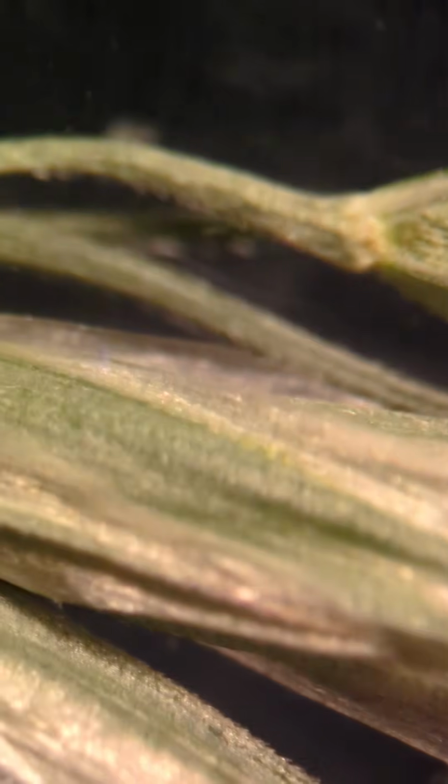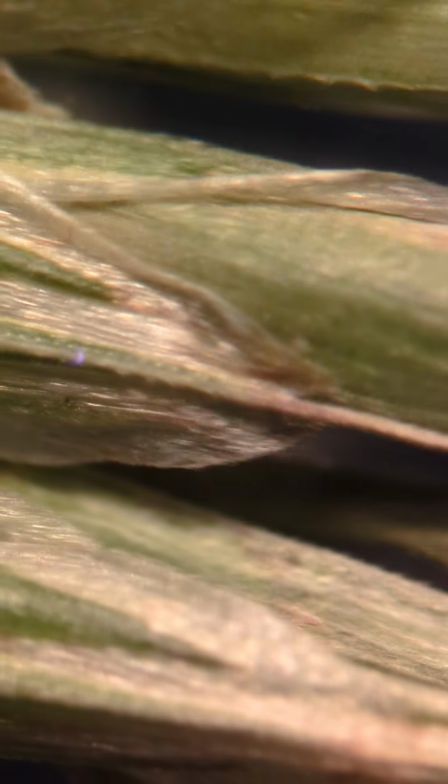See how it's all wavy, and it's got these little hairs all over it. And it's kind of like wee wee wee, because when the wind hits it, it shakes it, and all the pollen or whatever's in there gets knocked out of these things.